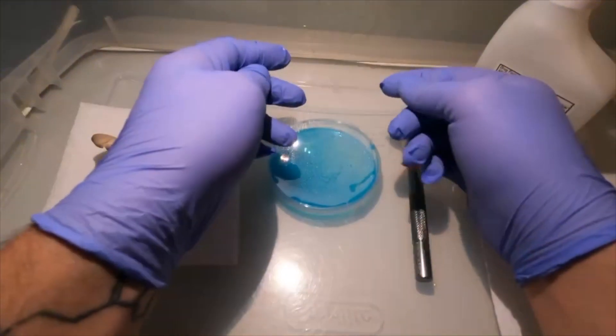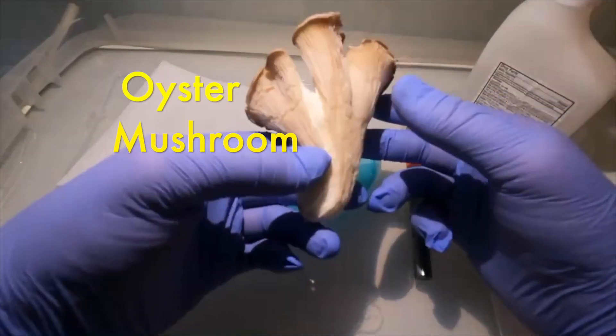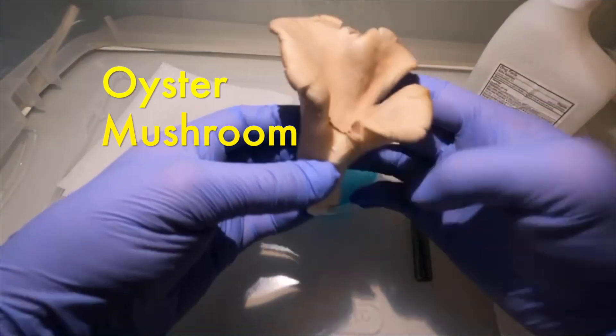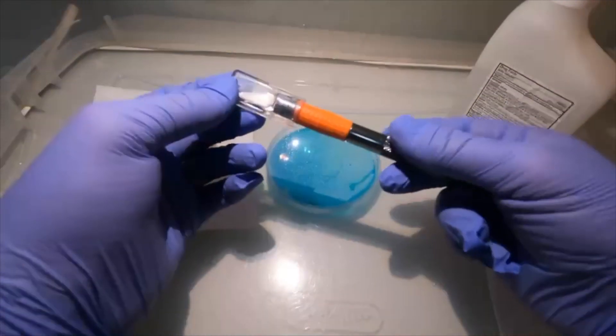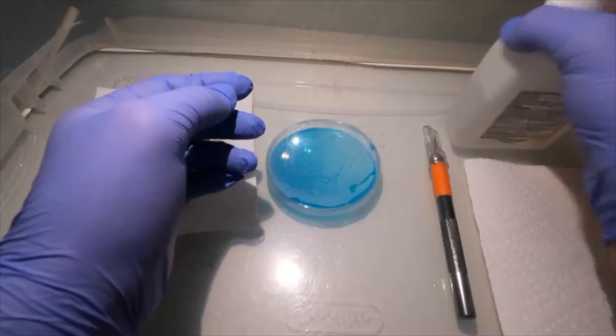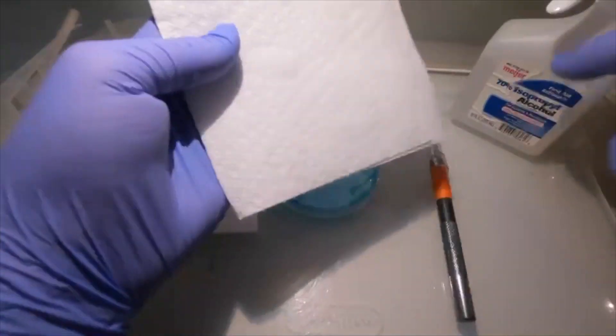Welcome back to Sporn Sprout. In this video I'm going to show you how to clone store-bought mushrooms. You're going to need a fresh sample of whatever mushroom you want to clone, a scalpel, some rubbing alcohol, and some pre-poured agar dishes.